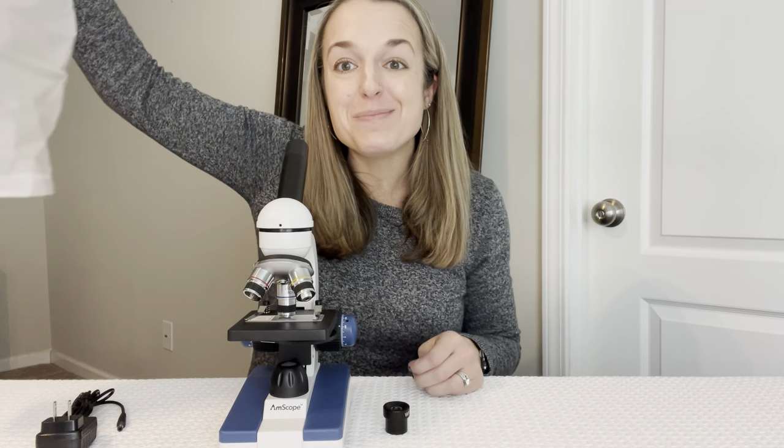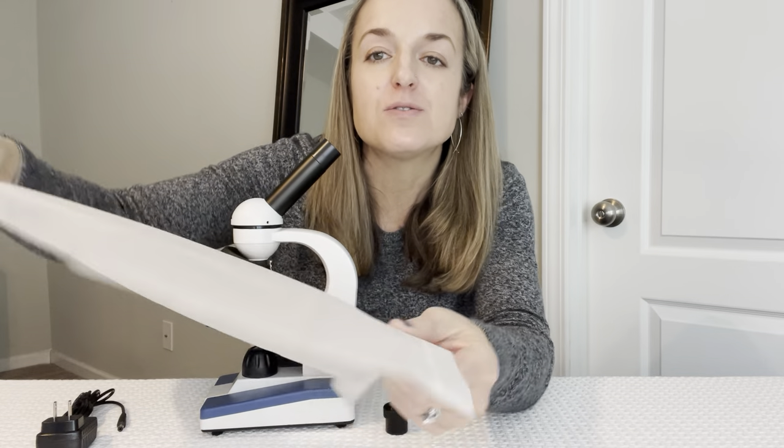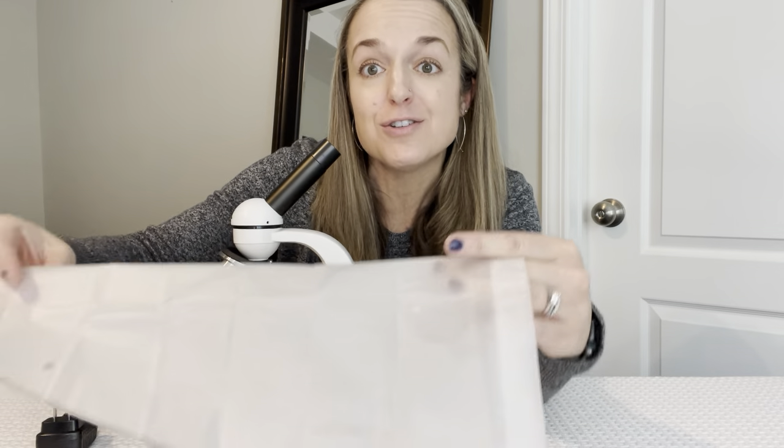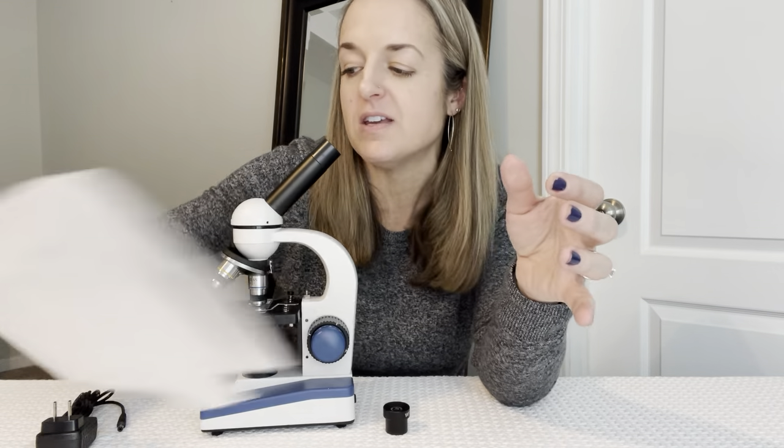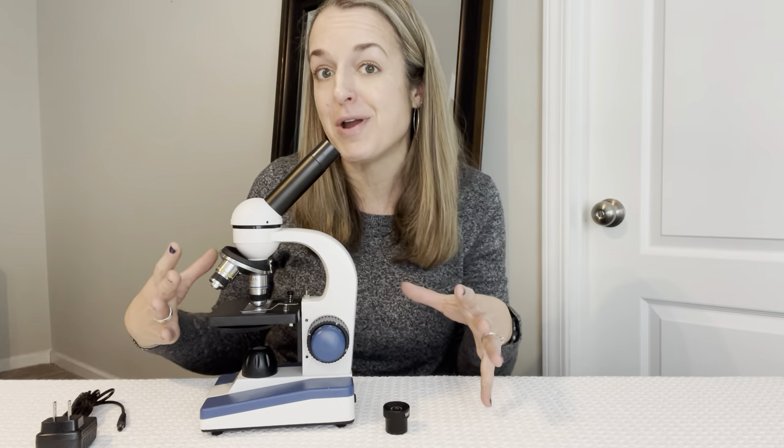This is the Amscope Microscope. As you can see, it comes with a cover. This reminds me of a shower curtain liner, just to give you an idea of the quality of this. It's nice that it comes with that to help keep the dust off your very nice microscope.